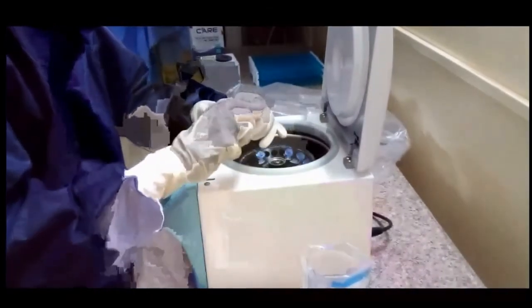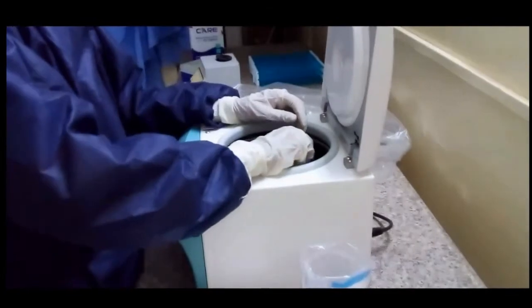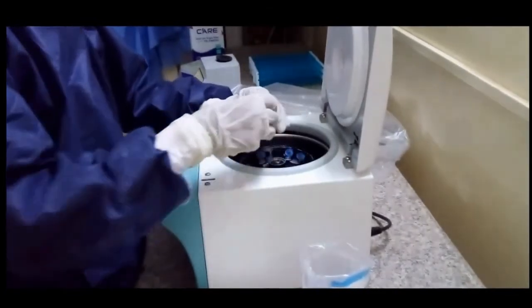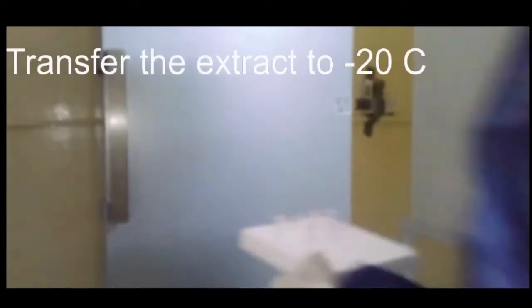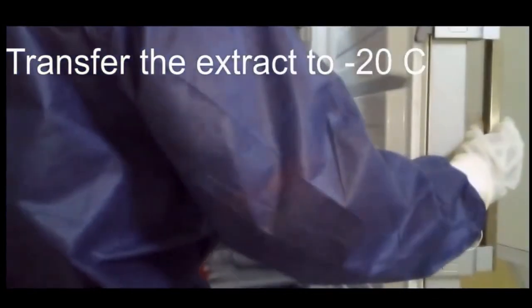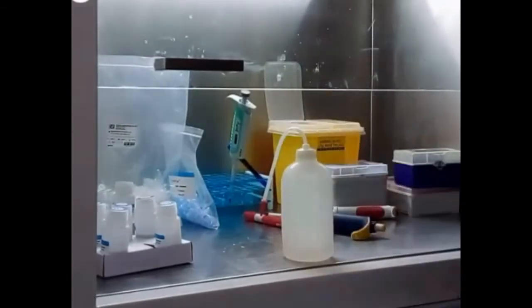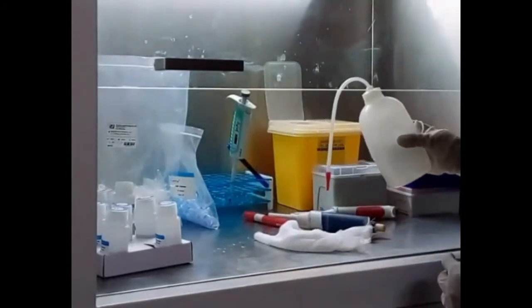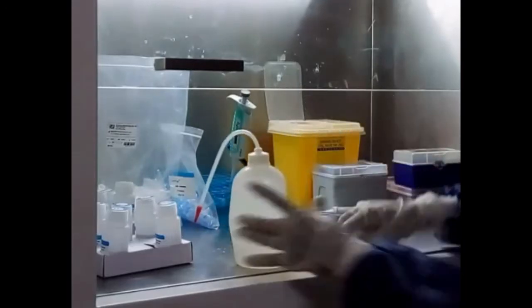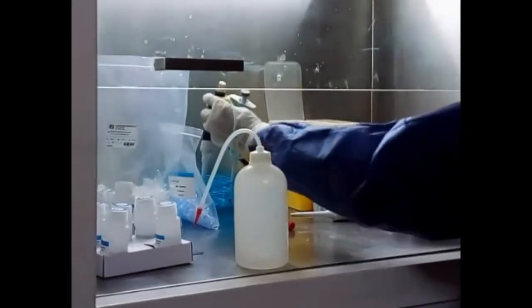Here is the extract. Let the extract cool at minus 20 degrees Celsius. Then bleach the cabinet.